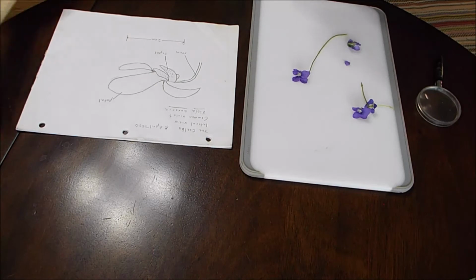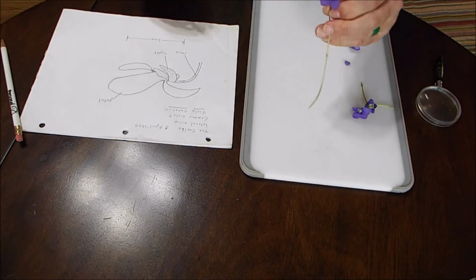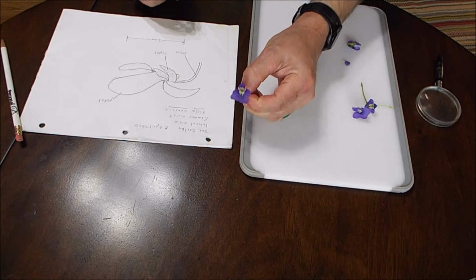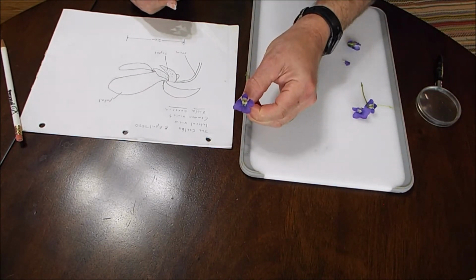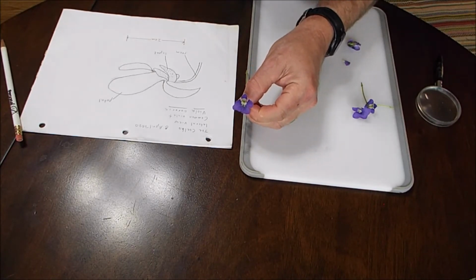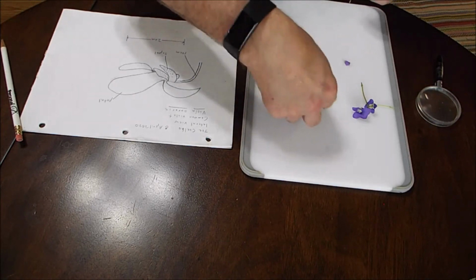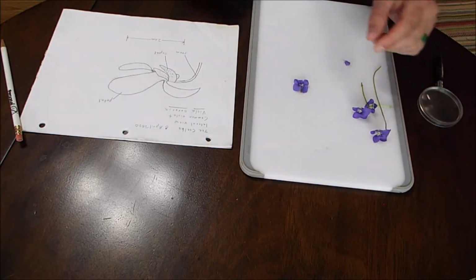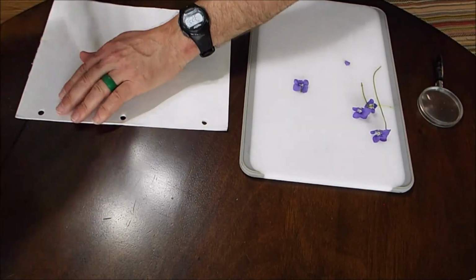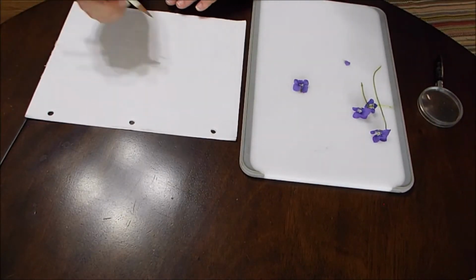Now, next task is to, let's draw another perspective, and we're going to go looking straight down the throat of the flower. I have no idea how this is coming out on the camera, but if we look straight down the throat, we can see some fuzzy things, which are in fact the stamens. So I'm going to take one, well, this one here is chopped up, so it's perfect. And I'm going to start an entirely different sheet of paper. We can put that one aside because it's done.